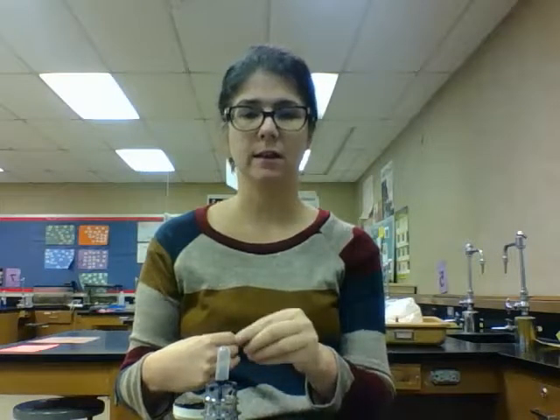And so you'll be able to see them as dark, kind of a brownish color when you look at it with iodine. We also have a couple other stains that we'll be trying, mixing around with. Crystal violet is one of them that we might try out because our bacteria that we look at, if it's gram-positive, you can see it with the crystal violet. It will attach to the, I believe it's the wall, not the wall, the membrane of the bacteria itself. So, anyways, you don't need to remember what each of them exactly does or memorize them, just that they help make it easier to see.